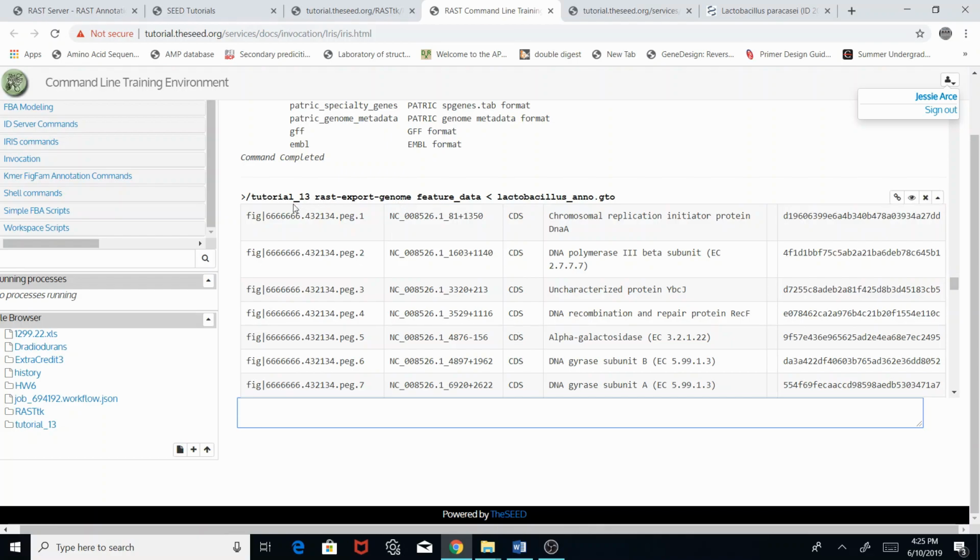We have some of the identifications, accession numbers, and then we have the FASTA information. If you were to look at this in FASTA format, you would have the greater than symbol, then this tag, and underneath it the actual protein sequence.